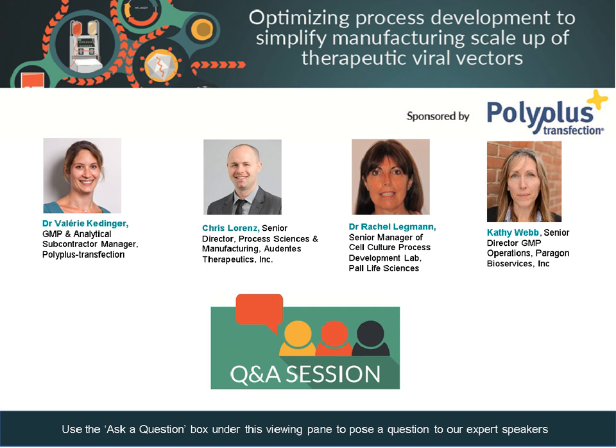As a multi-product company, we did not want to have different modalities and different platforms, one program using suspension, another one with adherent. We wanted the platform of the technology and the equipment so we could move readily through multiple programs relatively easily. Great. That makes sense. Thank you.